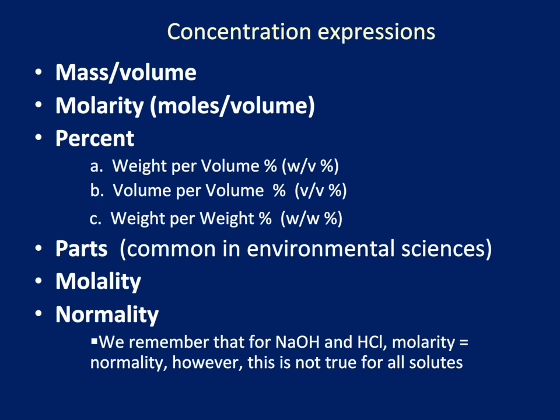In making a buffer solution, you first need to know how to calculate the concentration for that buffer or component of the solution. There are many expressions of concentration: mass per volume, molarity, percent, parts, molality, and normality. You should have already heard of all of these concentration expressions, so I want to go through how to calculate them in order for you to have accurate results in the lab.